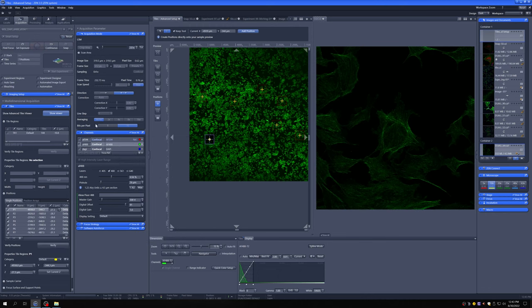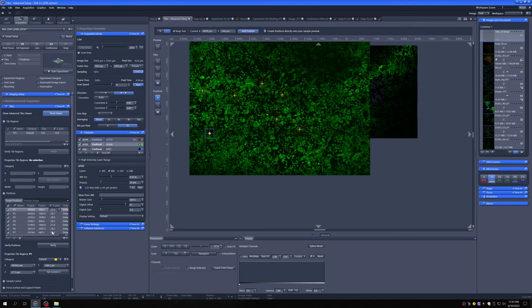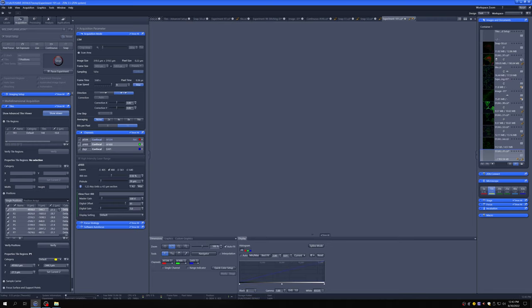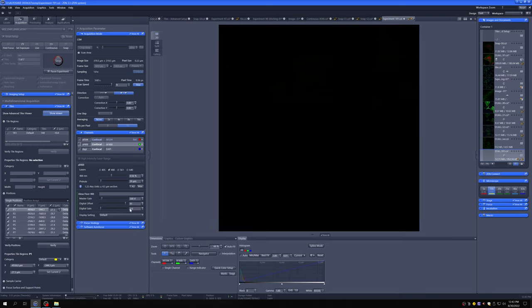And then what we can do is image all of these by just clicking start experiment. So you'll see this is not checked. We don't want to do that, but it's going to do these seven positions, which have all been sort of focused verified. So we can just say start experiment and pretty much walk away from it and come back to seven positions.